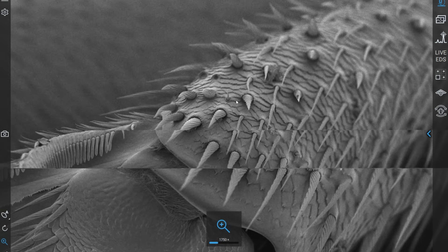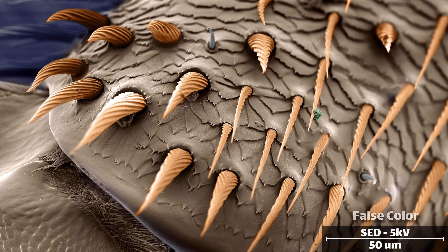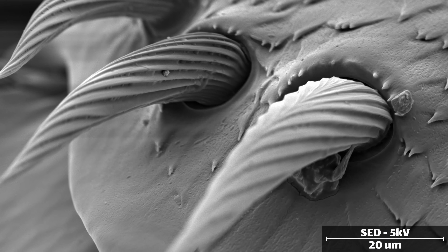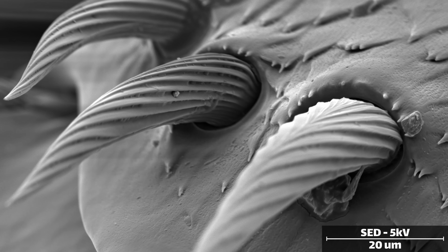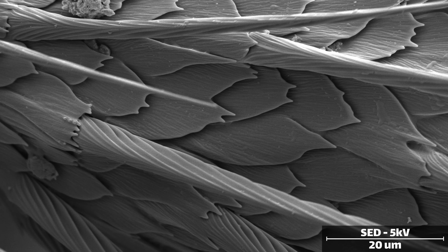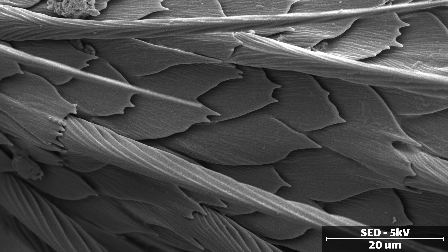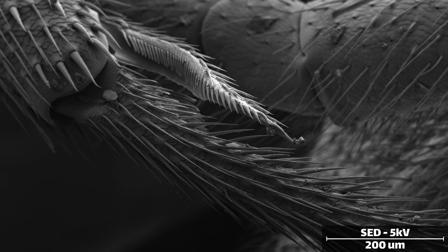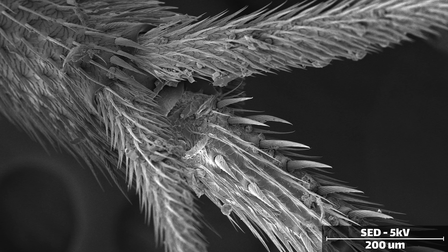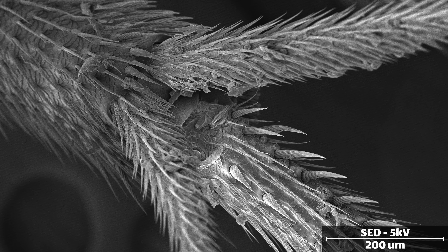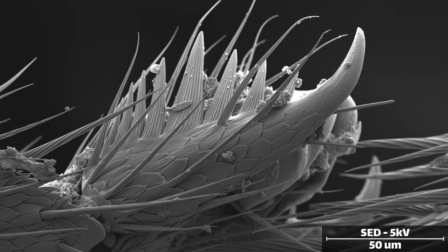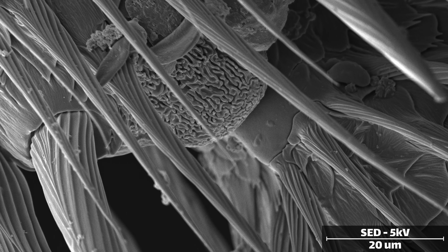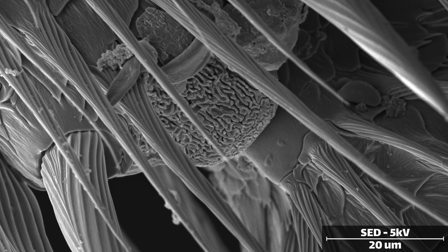I found it interesting how aggressive the features on this insect appear. The hairs covering its body are wickedly sharp, curved, and feature a lethal-looking spiral down the length. Its carapace is covered with scale-like armor with overlapping plates of exoskeleton. It just feels more dangerous than the fruit fly that we looked at, exuding a certain menace at the microscopic level. It could just be me anthropomorphizing since I know this particular insect is a predator, but nature rarely does anything for free, and so I suspect a lot of these features are adapted precisely to help this wasp survive in its environment.